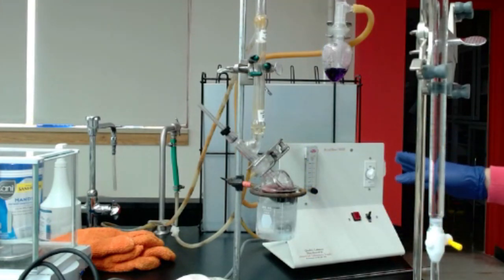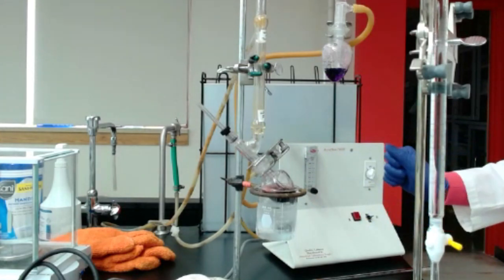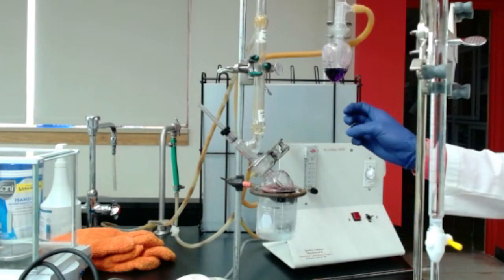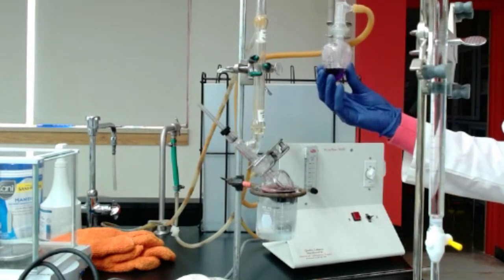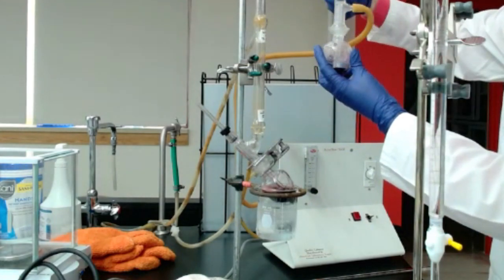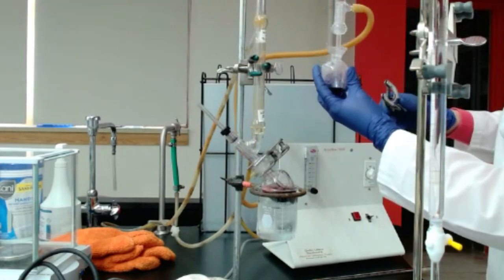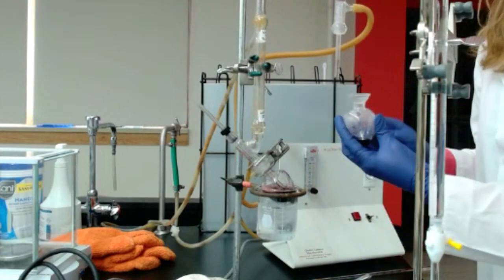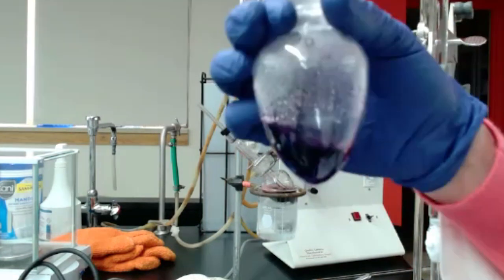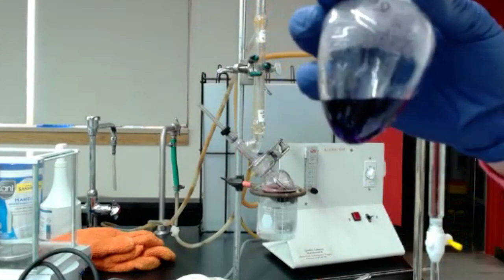Right now it's done, so the timer is off. I'm just gonna turn off that system. So we're gonna do exactly the same thing in terms of titration as for total SO2. We're gonna grab that flask D. So I open the clamp, make sure you hold that piece at the same time, otherwise everything is gonna fall down. And once again, you don't want to cut yourself. So you keep that flask and you can see it's really purple. That was the wine we did provide to you last week.